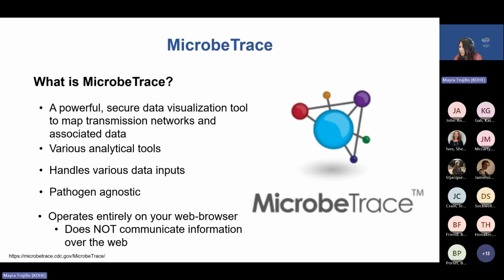So now let me give you a bit more detail about what MicrobeTrace is. It is a powerful, secure data visualization tool that can be used to map transmission networks. However, transmission networks are not the only things MicrobeTrace can visualize. It can also display histograms, SNP heat matrices, nucleotide sequence alignments, phylogenetic trees, and maps showing geographic locations of the uploaded cases. Because MicrobeTrace supports these different visualizations, it's able to handle a variety of data inputs.